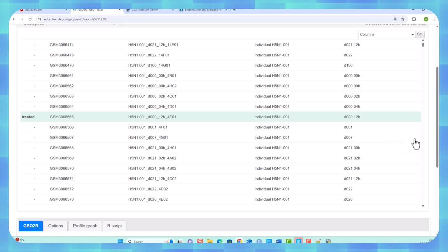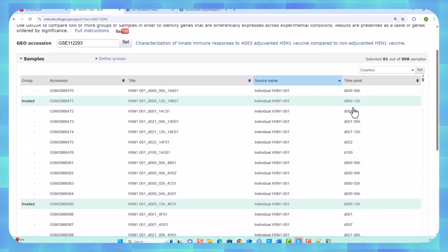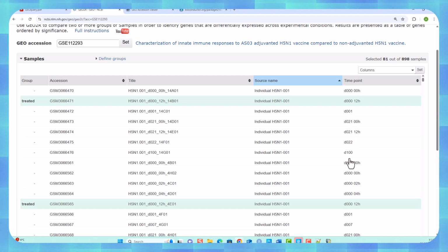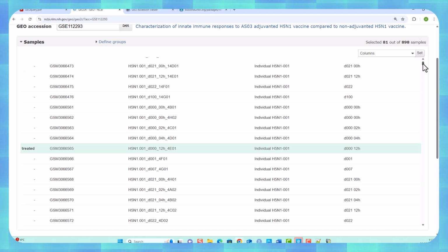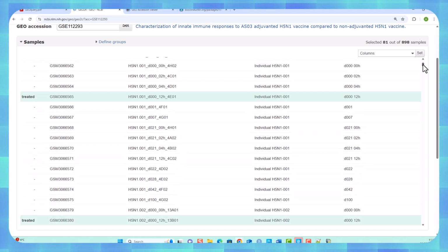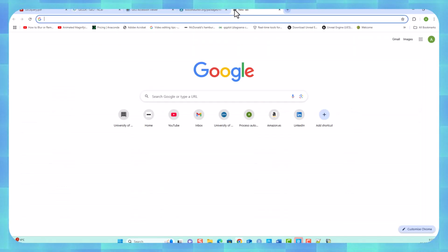Make this full size, and start again because I've lost count. So 1, 2, 3, 4, 5, 6, 7, 8, 9, 10, 11, 12, 13 was to the DO1. 14, 15, 16, 17, 18, 19, 20, 21, 22. So there are 22 time points for each one of the patients, supposedly.